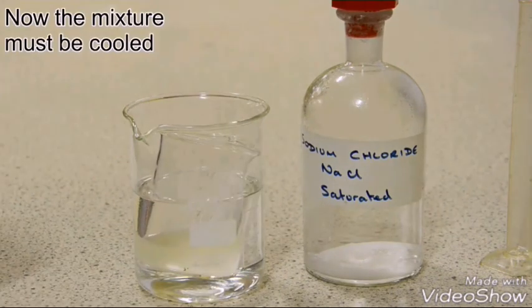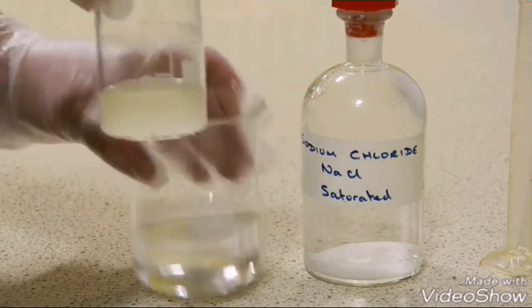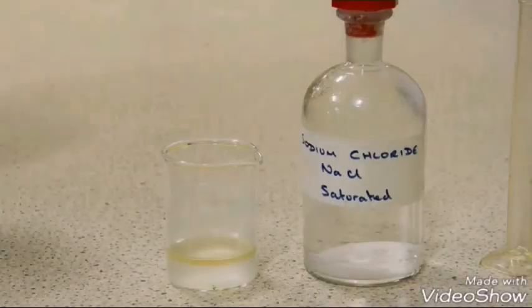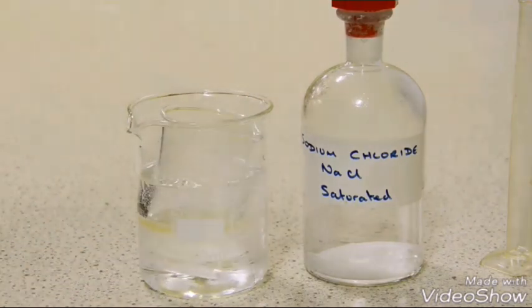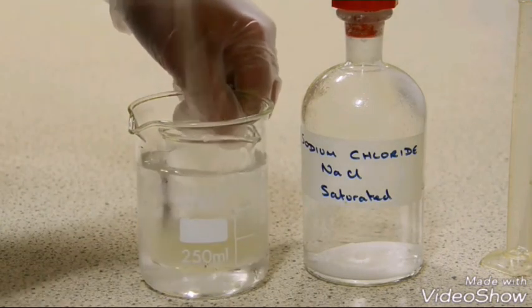After this, we're going to need to cool the mixture in iced water. This is going to help the soap to precipitate out. The longer we can possibly leave it, the greater the yield of soap is going to be. I'm going to leave my mixture on ice for about 15 minutes, stirring occasionally every couple of minutes or so.